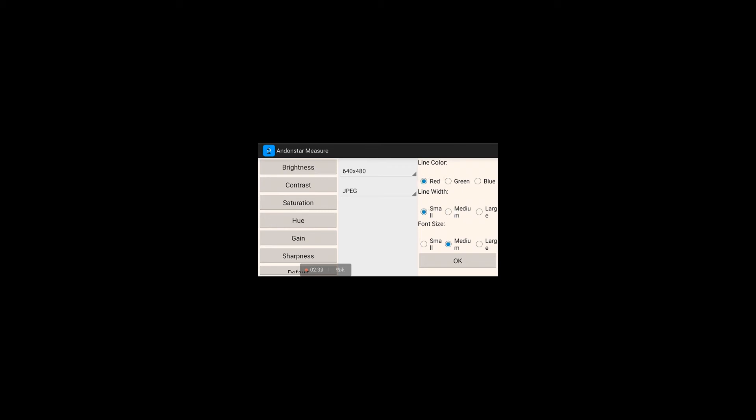You can choose picture resolution, format, and line color — options like medium green, red, or small. This video is just a brief introduction of how to use the Wi-Fi adapter and the Android version software. We also have an iPhone version. If you have any older models, please try it. You can buy from my store individually or as a bundle — or you can buy just the Wi-Fi adapter. I hope you guys enjoy my video, even though it's a short one. Goodbye!